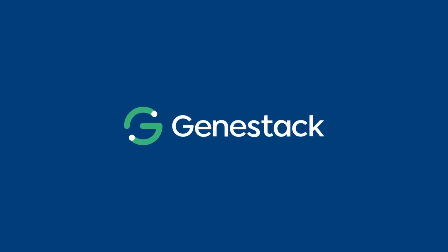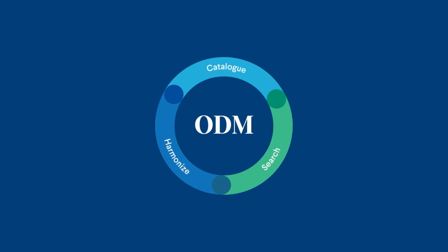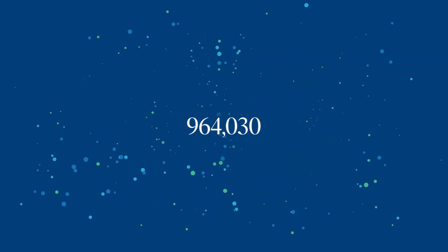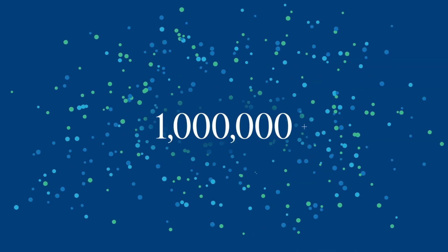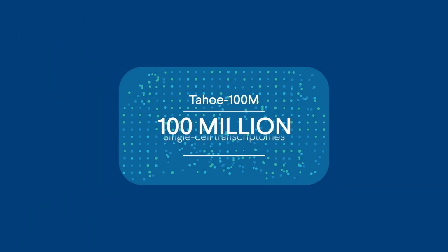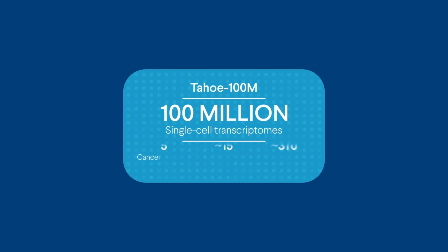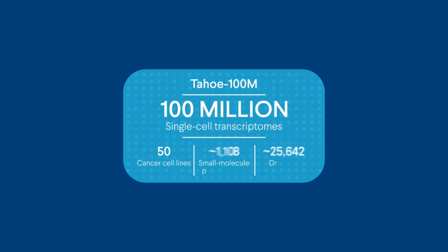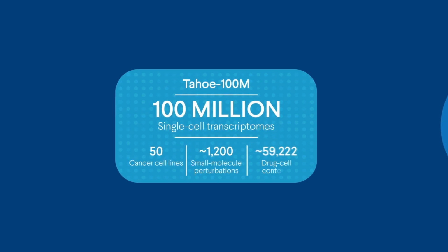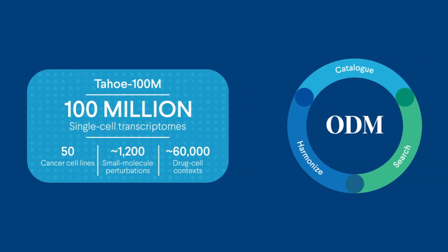Genestack's Open Data Manager is a governed data platform, purpose-built for life sciences at scale. To see this in practice, look at Tahoe-100M, a landmark public single-cell dataset from Tahoe Therapeutics. We've ingested 100 million transcriptomes across 50 cancer cell lines and hundreds of tested compounds. The scientific value is extraordinary. The operational challenge is equally significant.